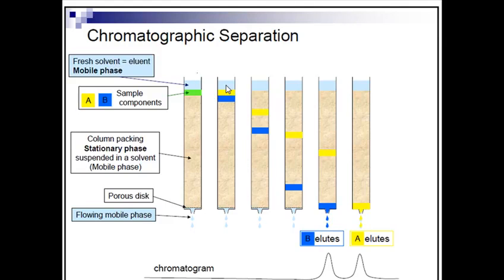The action of the mobile phase is to enter at one point and to elute from another point. This is the function of the mobile phase molecules, and mobile phase molecules have a force, and that force helps to make the analyte molecules flow. We add samples, and the sample travels from one place to another, in this case from place A to place B via these mobile phase molecules, which is water. So water carries all these things, and water is eluted rapidly, but it carries sample A and B.